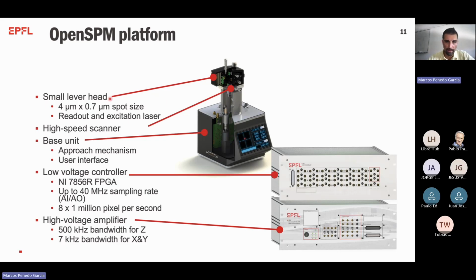Okay, in our case, we have the AFM head that is prepared for high speed, and for high speed, you need to have small cantilevers that have high resonances.